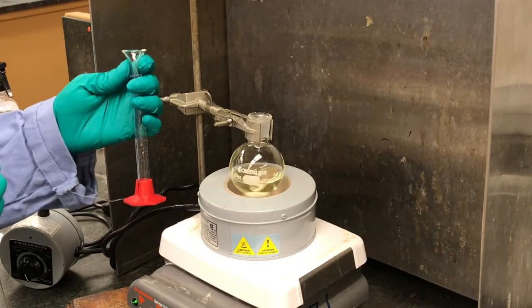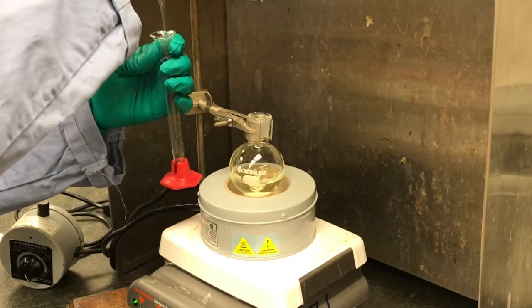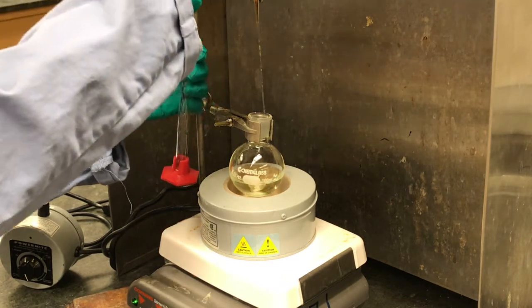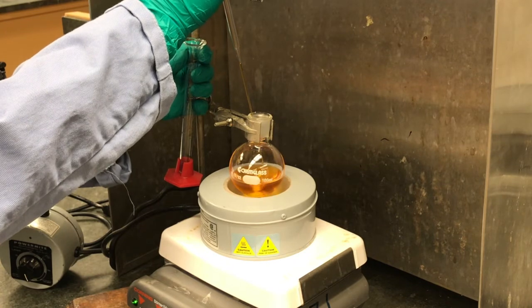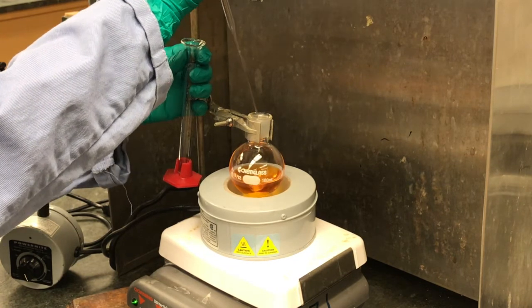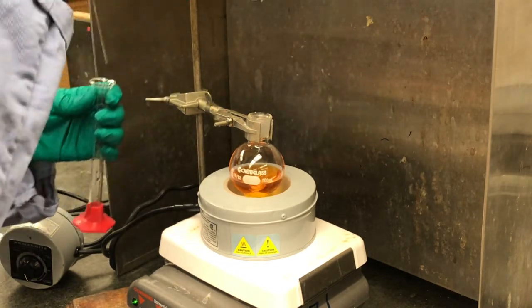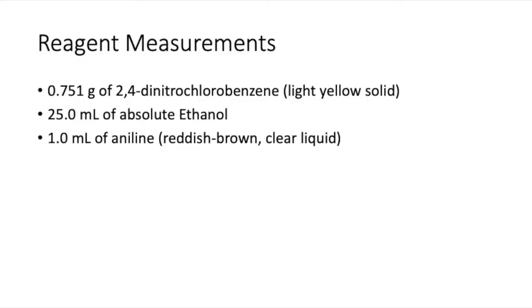Okay, so now that our 2,4-dinitrochlorobenzene is pretty much dissolved, we're going to add our aniline to that mixture. And then here's just the summary of all the measurements that we made, in case you weren't able to see them on the video.